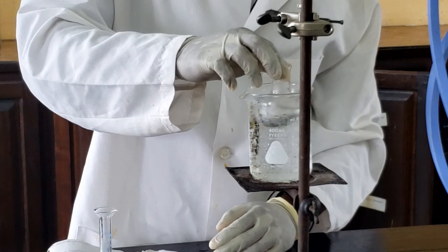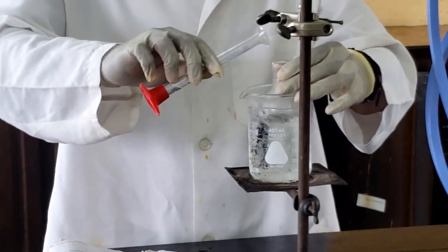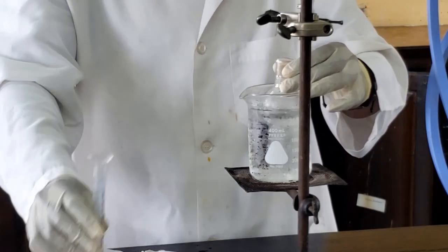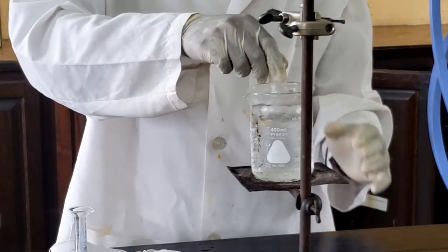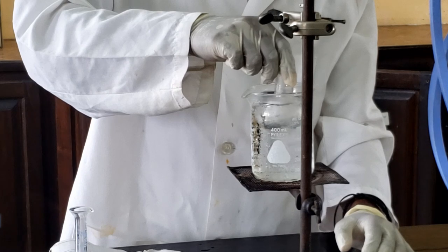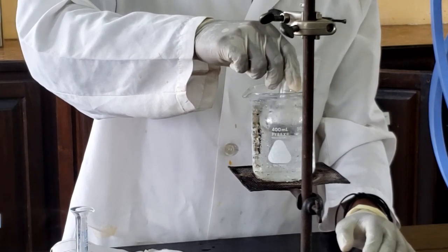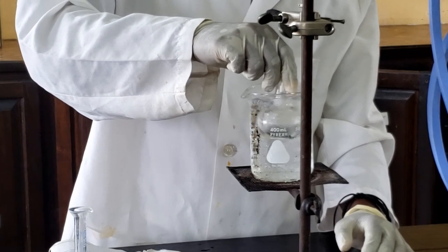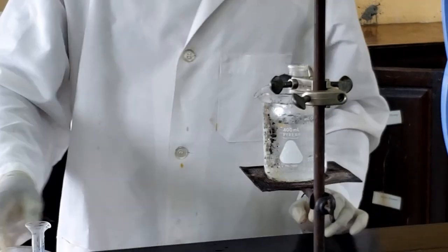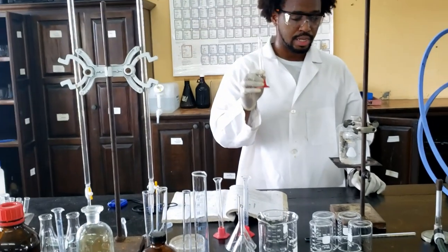Just unclamp and swirl. Okay, so now that we've finished adding the two acids, I have here 3 grams of bromobenzene solution.